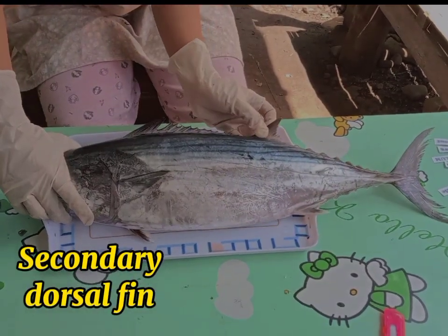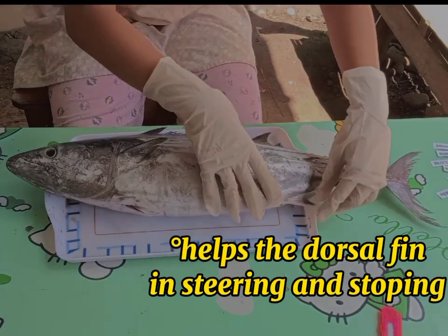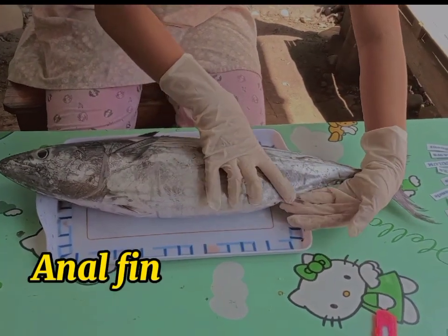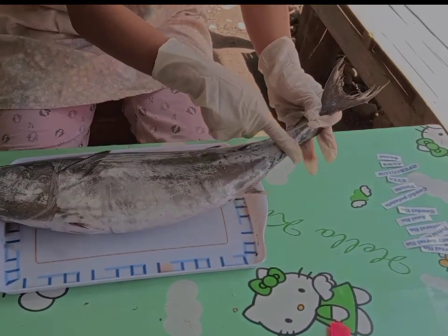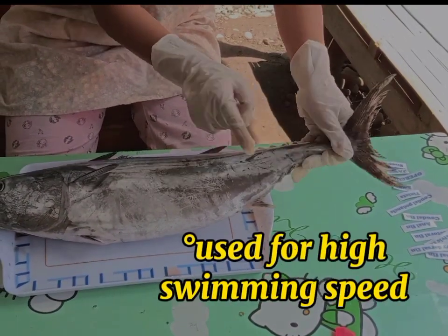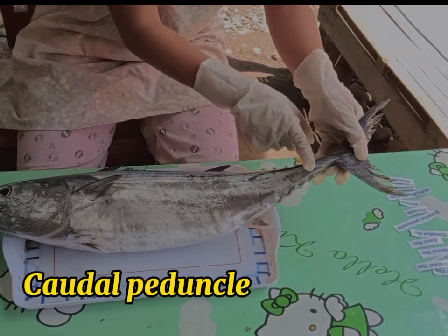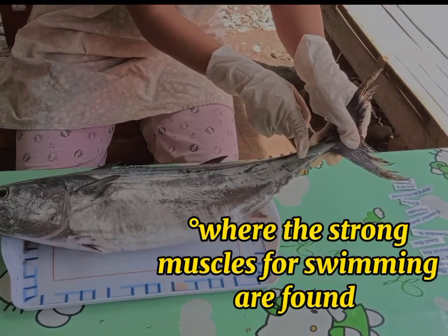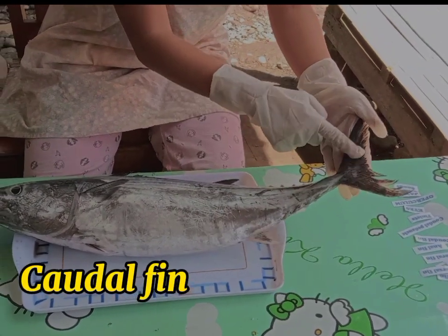Secondary dorsal fin. Next, the finlets — this is the finlets. The caudal peduncle — this is the caudal peduncle. And lastly, the caudal fin.